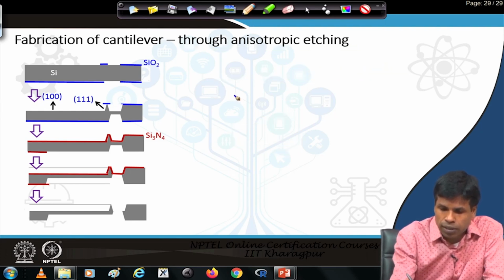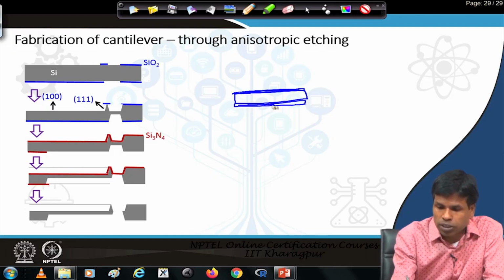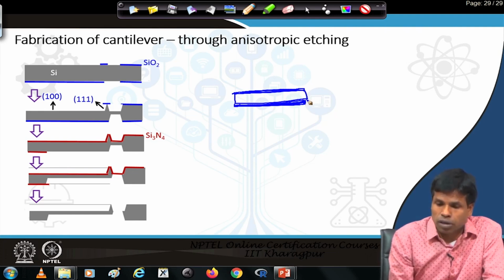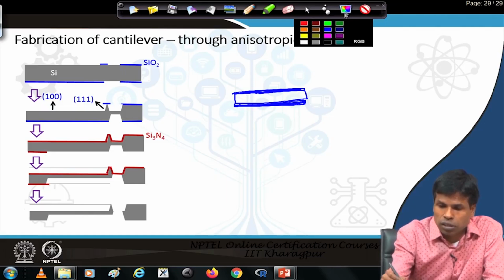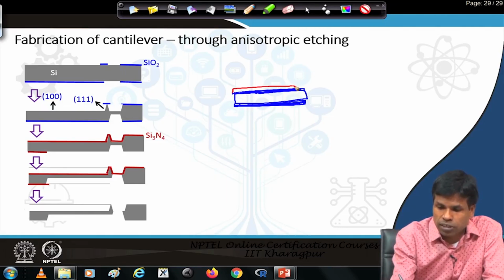You can take a silicon piece, then coat it with SiO2, either by thermal oxidation or by wet oxidation. After a continuous layer is formed, then one can coat the resist material.